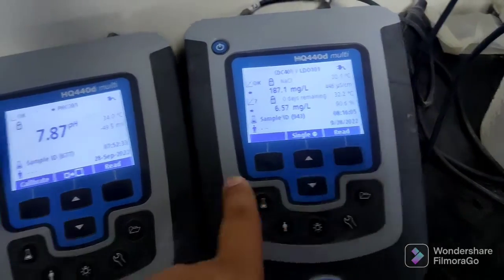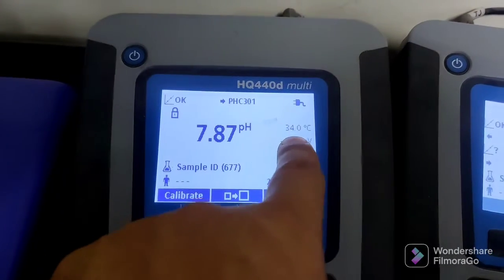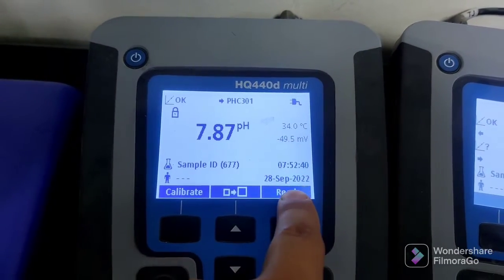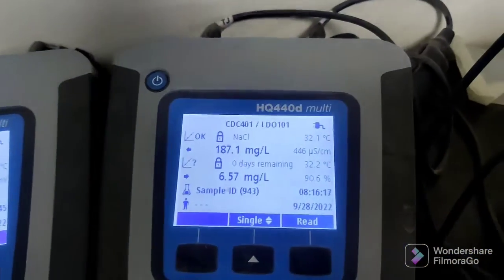This one is for connected settings and this one is for the reading — this is specially for the reading. Once you put your pH sensor in the water, this shows the temperature. You can also see the date, time, and sample ID everything here on the display.